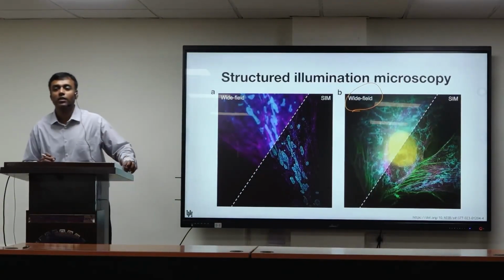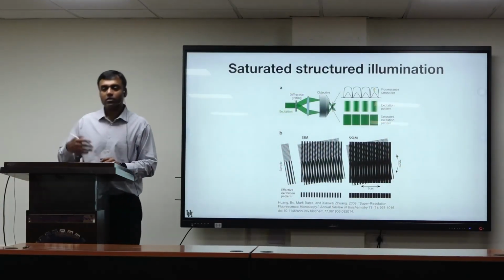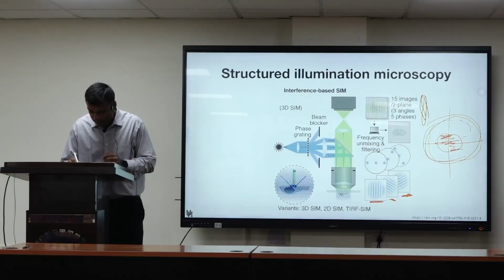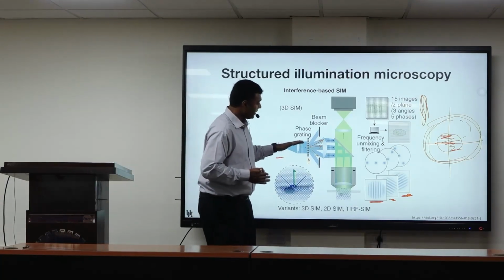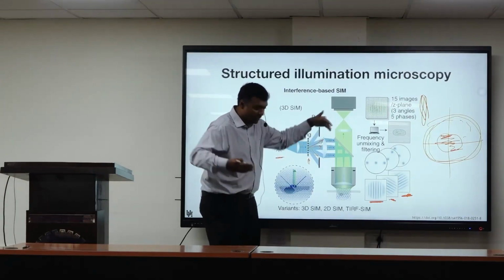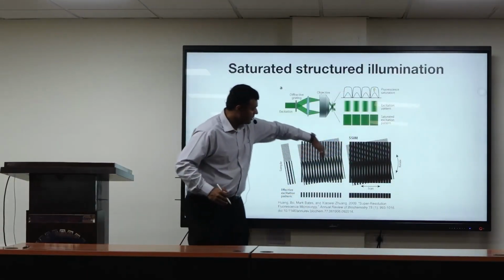Okay. So this is how this approach works. The related thing is, how do you create this kind of cosine pattern? The way you can create a cosine pattern is to take a slit source and put a grating here. So there is a zeroth order which goes through just like before, but there is a first order in this direction and this direction, right? Then you interfere them together. You have two plane waves coming together and interfering. Then it creates this kind of pattern.